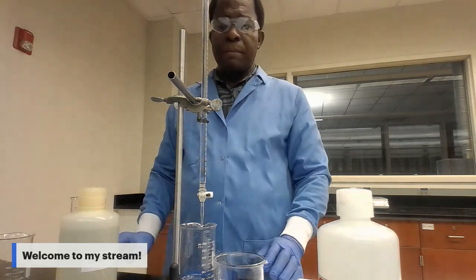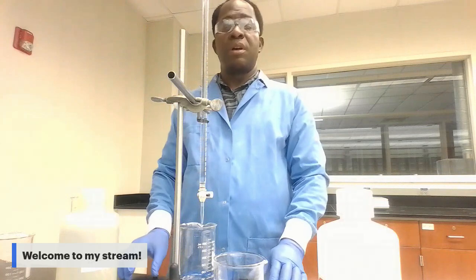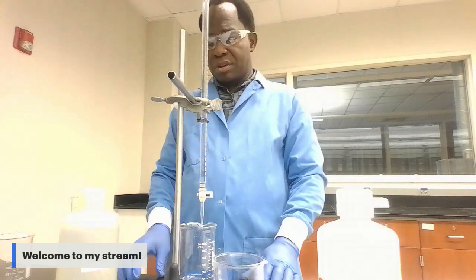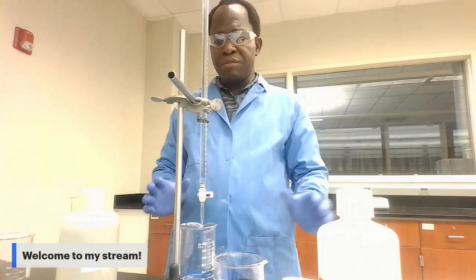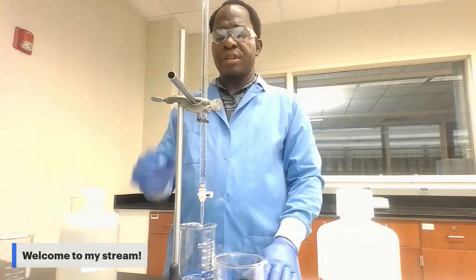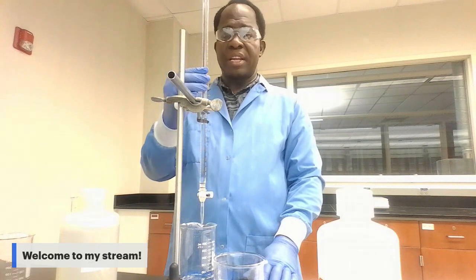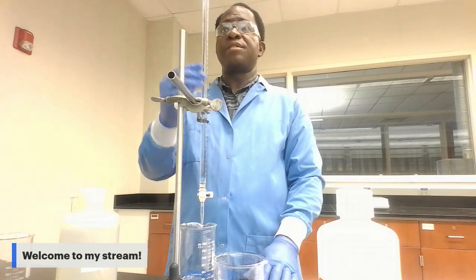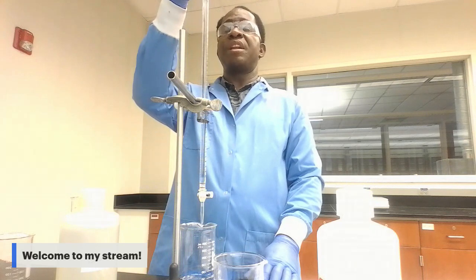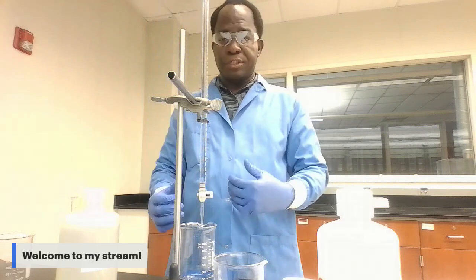One thing I want to make sure you get before we move to the second part is that your burette is clean. In order to do that, you fill your burette to 50 milliliters, to the 0 mark, and then you drain it out.